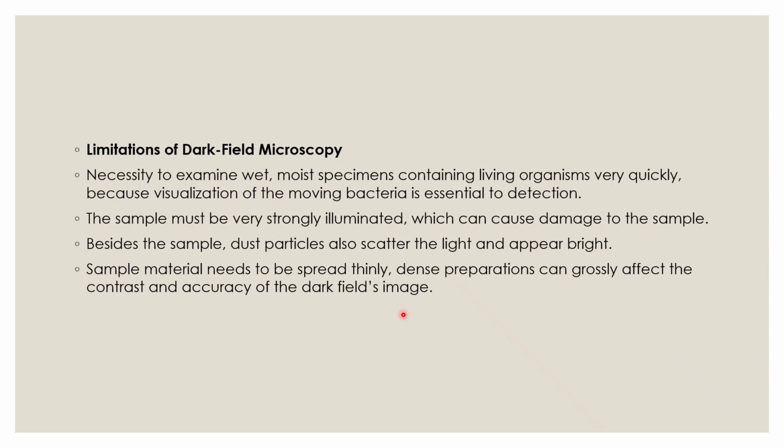And yes, it has to be done very quickly also. Since it is a live organism, you have to do it quickly. So all these are the limitations of dark field microscopy.